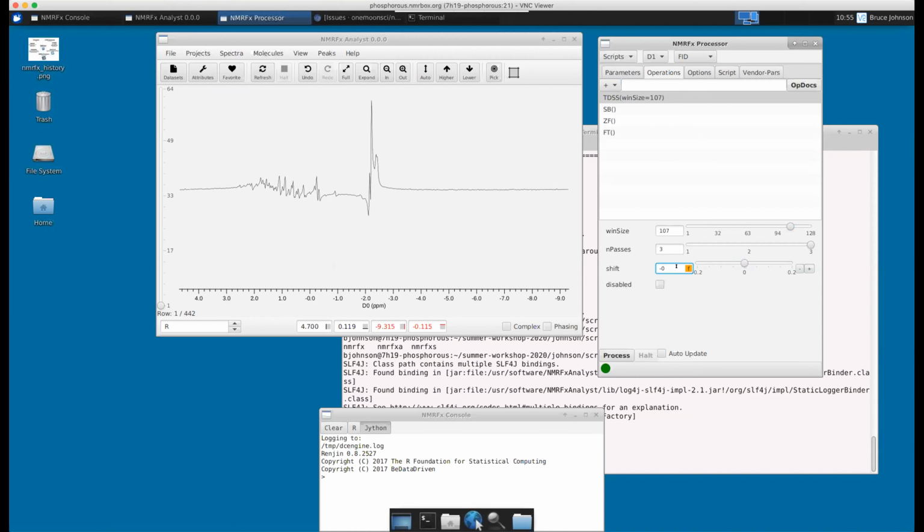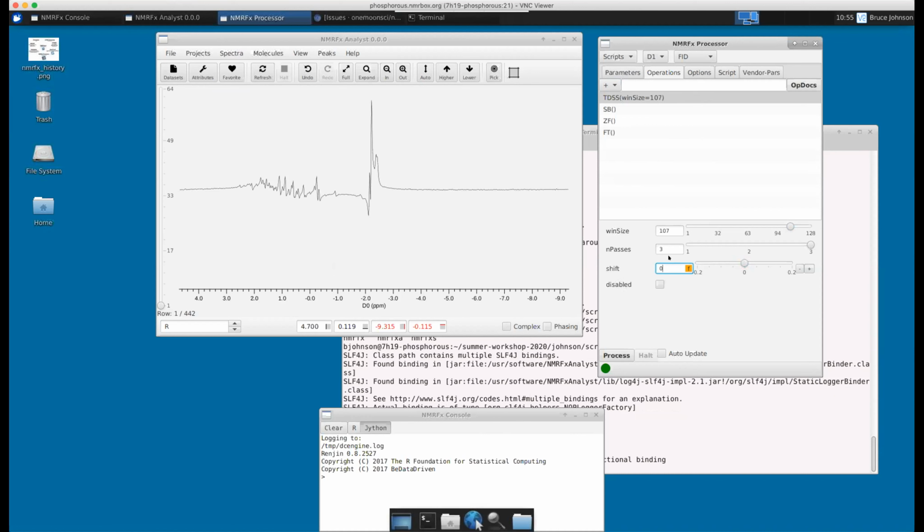Hey, Bruce? Yes. Sorry. So in real life, when we collect data, everybody, we put considerable effort to make sure that our solvent gets suppressed in the raw data itself. Now, like magic, you're showing that the water just goes away pretty well without affecting the amide protons there. So there must be something got to give, right? So what is the caveat here?